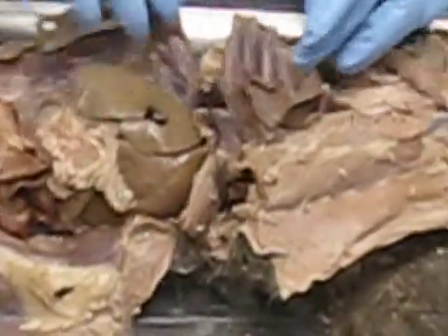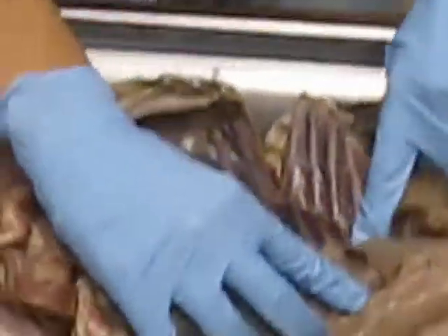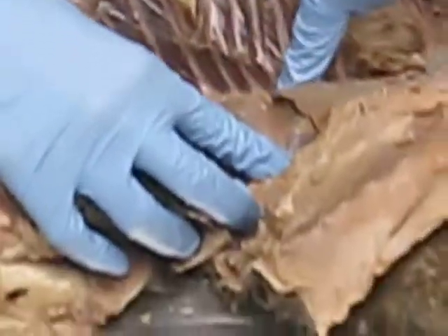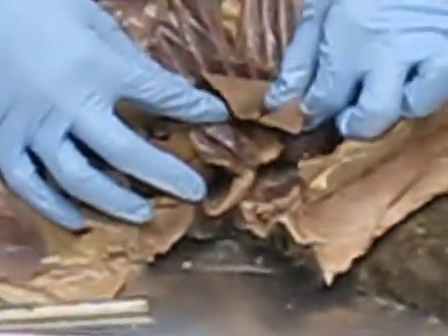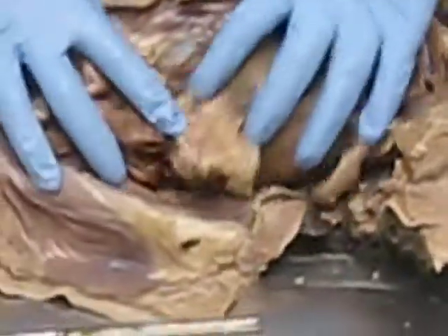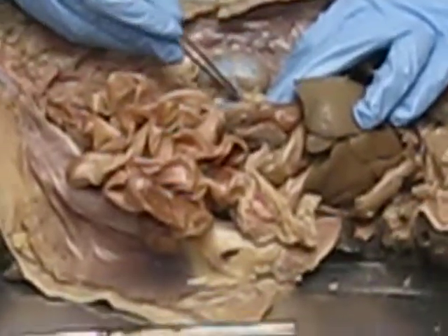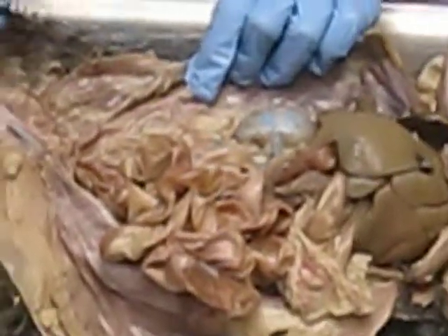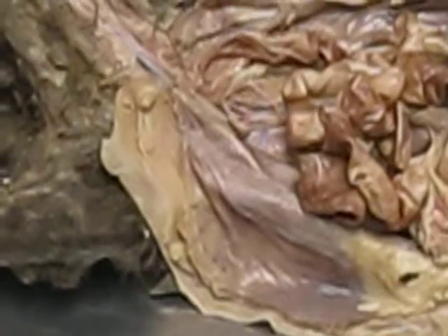There's the azygous vein. So if you just push over the lungs on the right-hand side, you'll see a big vein that's kind of running down here, and it serves the ribs, and that's the azygous. So that's different from the posterior vena cava. Alright. Posterior vena cava. There's big, big renal veins in this cat, left and right. There should be gonadals, but they didn't dye for some reason, but there should be. And then down here, actually just saw that on the board.